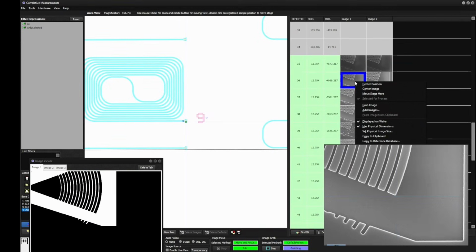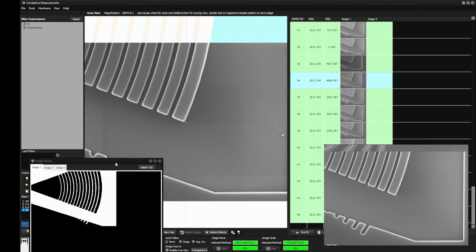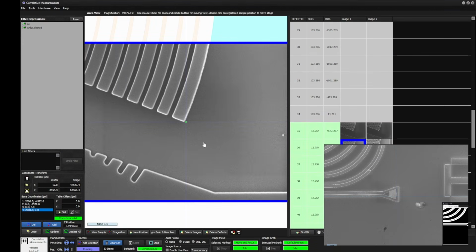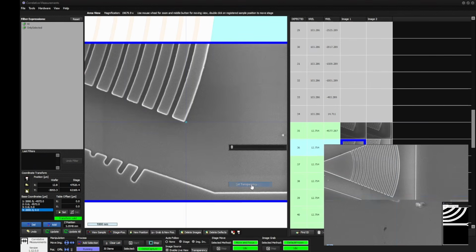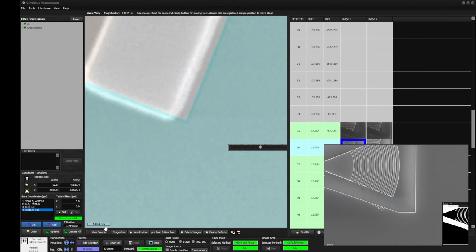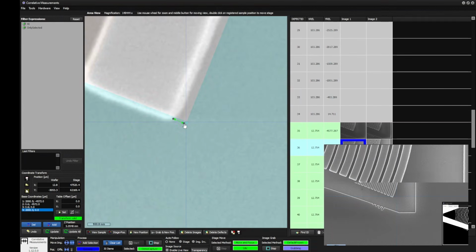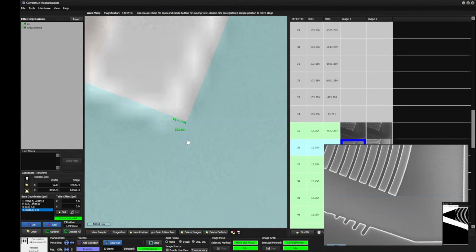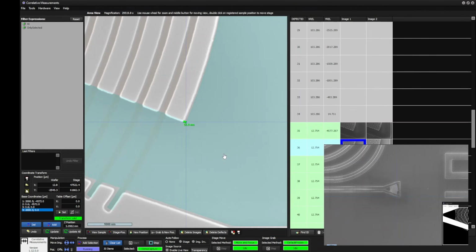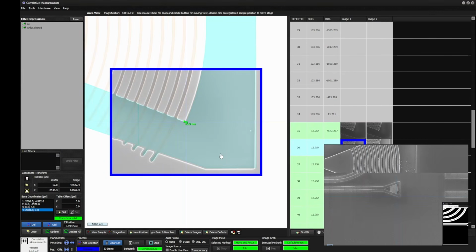We should check the precision on this image, and then we should disable the display of that image, otherwise we can't see the other image below, and you see there is nearly no deviation between them anymore. If we measure this, this is just 50 nanometer. So with this two-step way, we now hit very precisely. And that's very important if you want to find small structures.